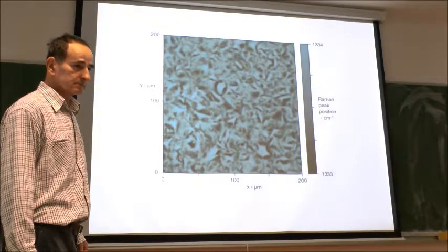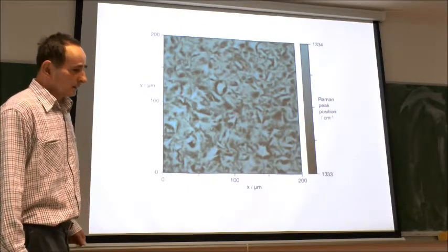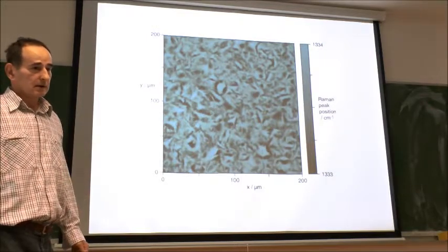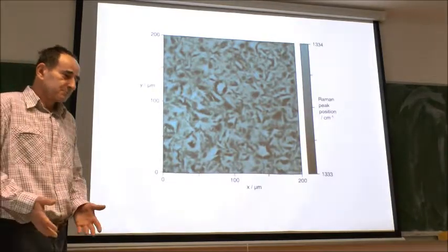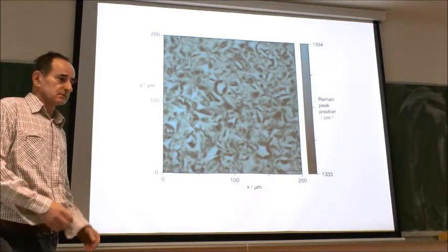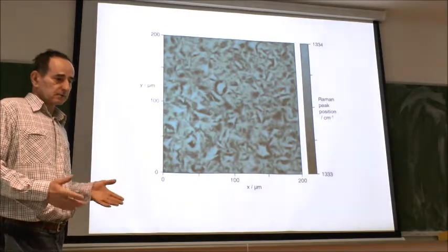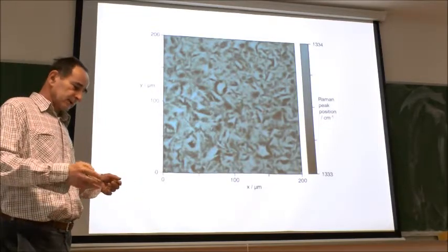What is the maximum sample size that can be examined? Say, can I, for example, scan the surface of this notebook? Not exactly. It should fit under the optical microscope. Well, there is some space, but you cannot bring the card. So we are talking about millimeters or centimeters? There are centimeters. But on the other hand, I didn't mention that there is an option on the microscope where you can bring really big objects. So you can measure Raman from the side.